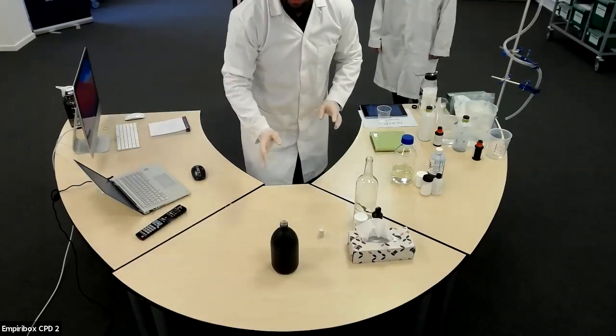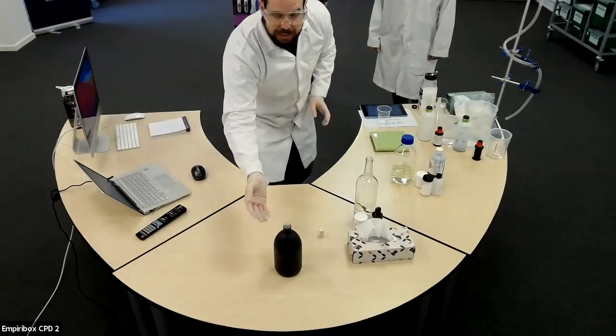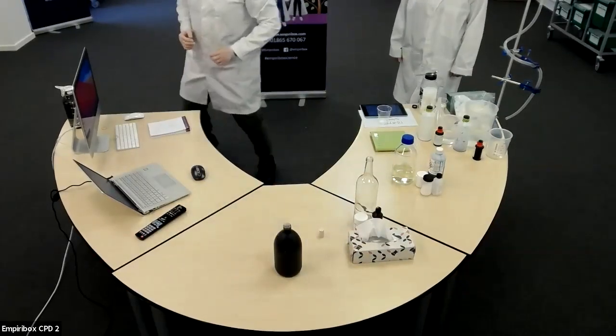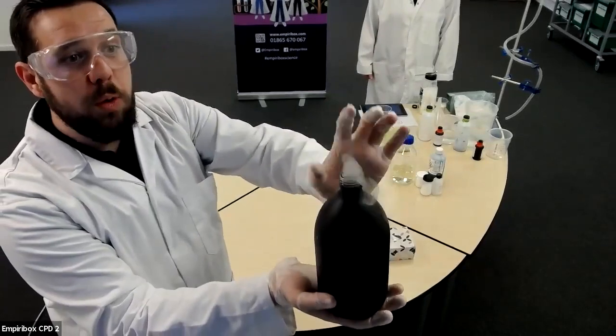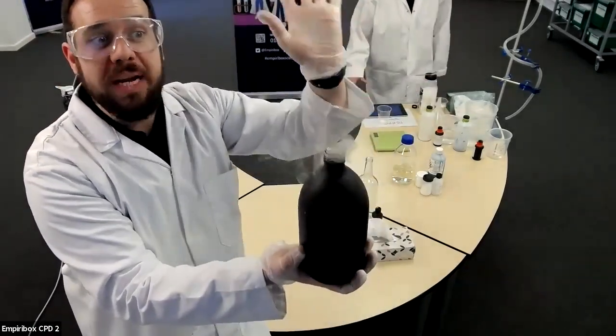I don't know if you guys can see it that clearly. Can you see any smoke coming out of that at all? I'm not sure if I need to do that a bit closer. Yes, you can see smoke. I'm going to bring it a little bit closer to the screen so you can see all that wonderful smoke coming out of here. Now, it's not billowing out like I wanted it to, but it's all right.